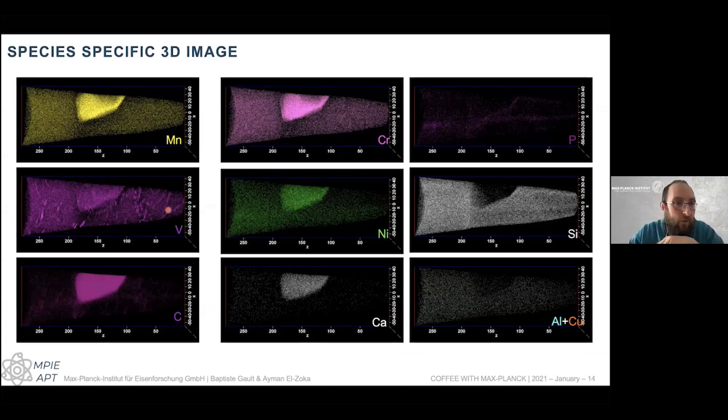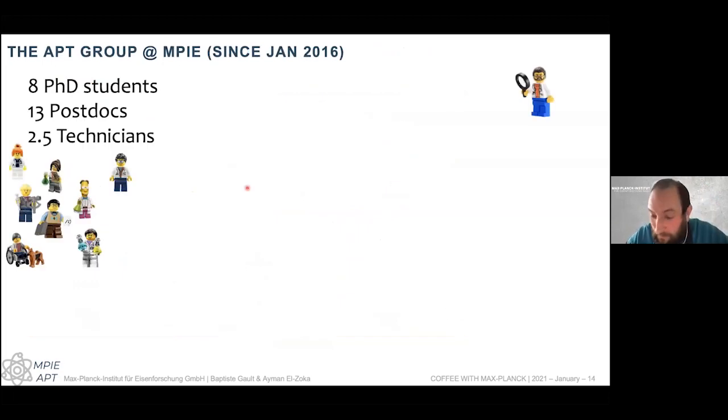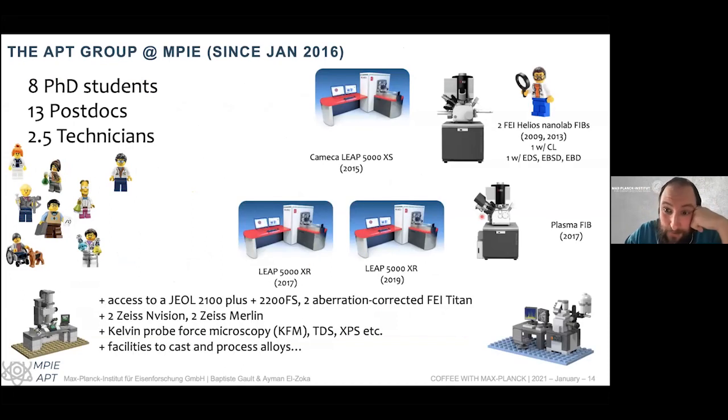And this is really the purpose of what we do in the Institute, as Professor Haber was saying in the video. So when I was a young student, maybe 15 years ago, there were about 20 atom probes in the world, and now there's probably about 100. There's quite a density in the United States, and quite a high density also in Europe, but MPA is the best equipped lab. We have 3 machines and 3 focused ion beams that are the microscopes we use to make the specimens.